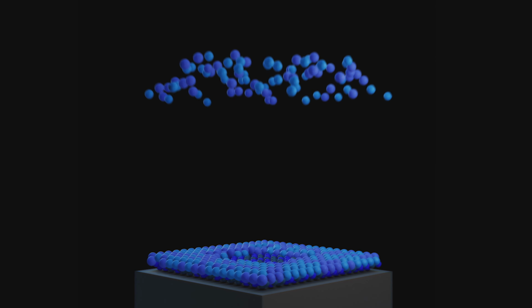The focused ion beam has become a powerful tool for site-specific 3D imaging of submicron features in a sample. In this FIB tomography technique, the sample is sequentially milled using an ion beam perpendicular to the specimen, while imaging the newly exposed surface using an electron beam.